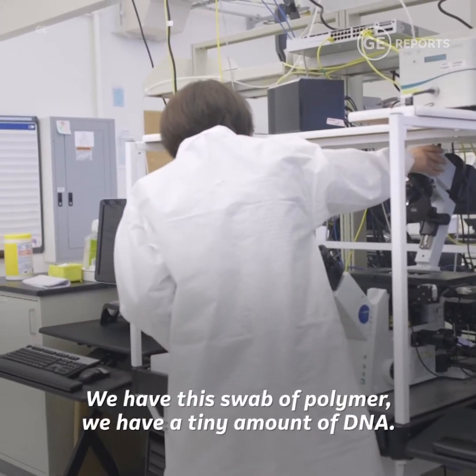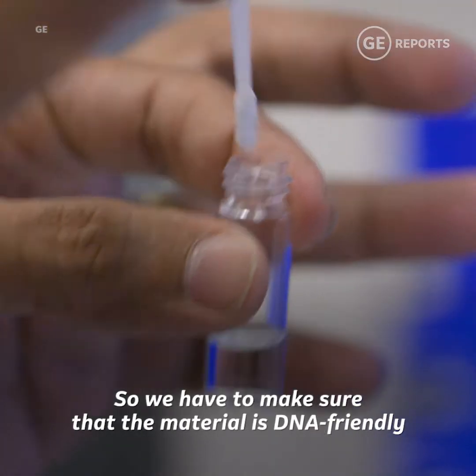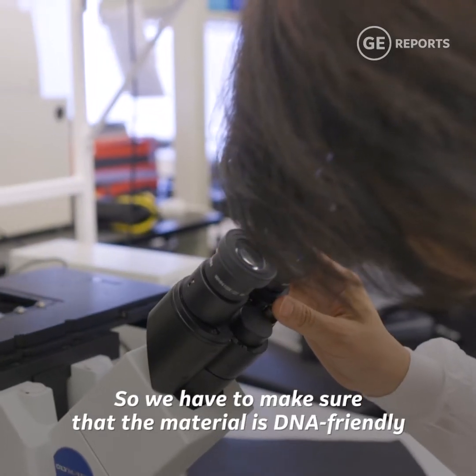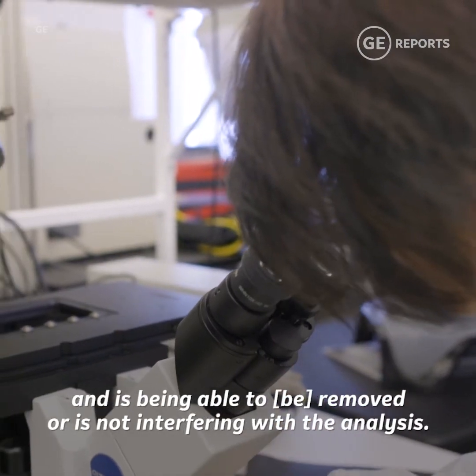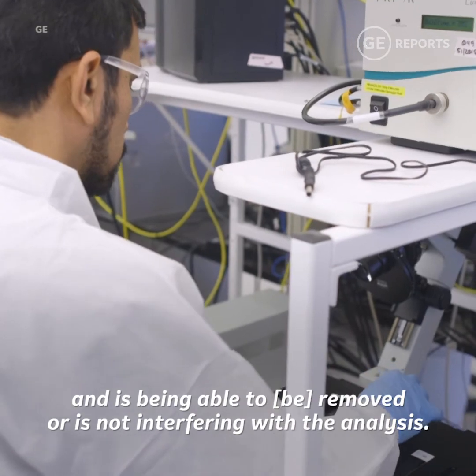We have this swab polymer and a tiny amount of DNA. So we have to make sure that the material is DNA-friendly and is not interfering with the analysis.